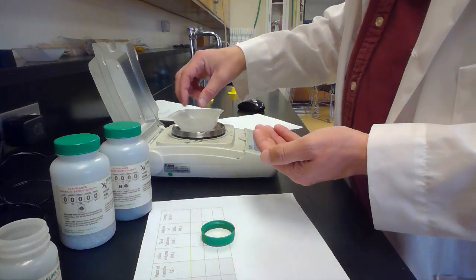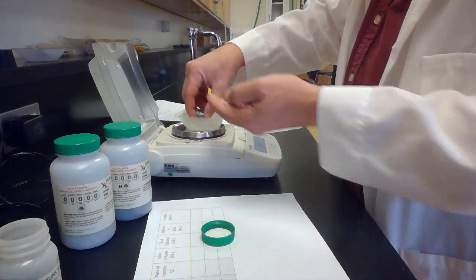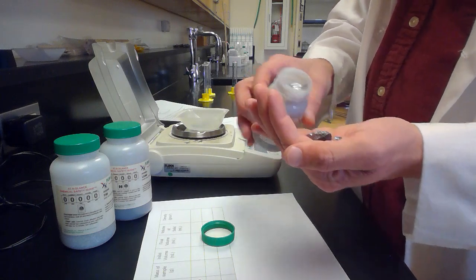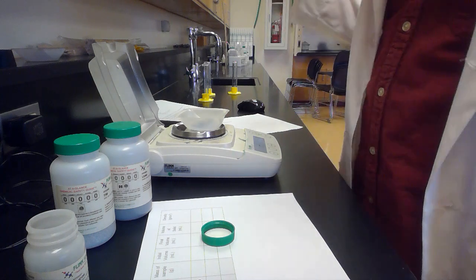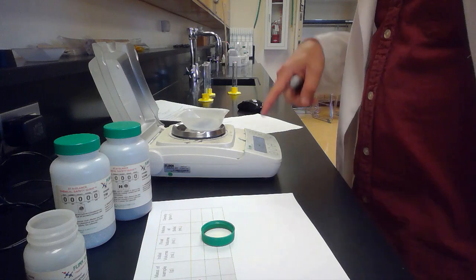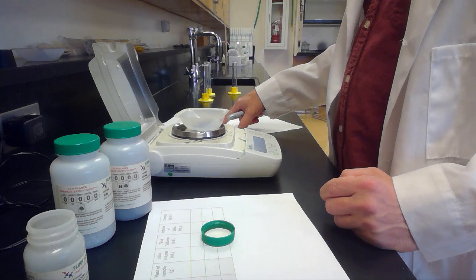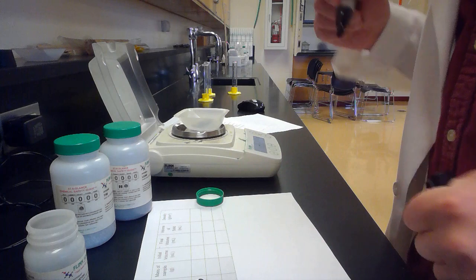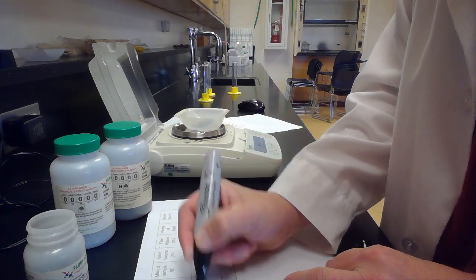So it says we want about 8 grams. So here, let's put this on here. Maybe a few more. That's probably pretty good. Okay. So right now it says 12.52 grams on my scale. So it says measure the combined mass of the beaker plus the solid. So in my first box on my data chart, I'm going to put 12.53 grams.